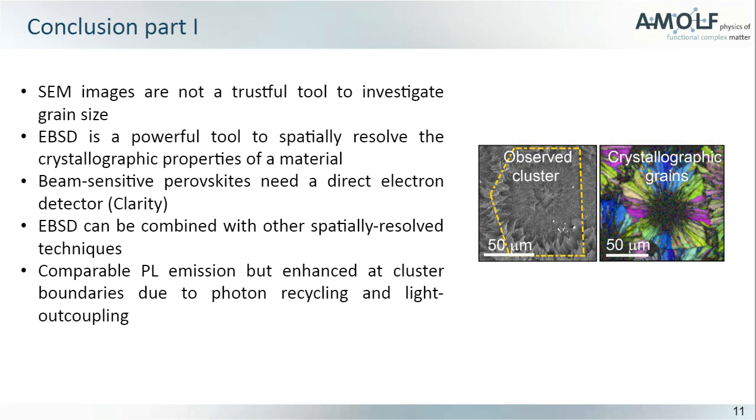And also EBSD is a very powerful technique, not only for structural information, but also to correlate structural information with other properties that a material can show. And this is, I think, great about this technique.